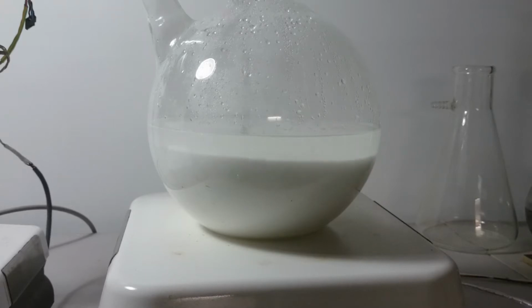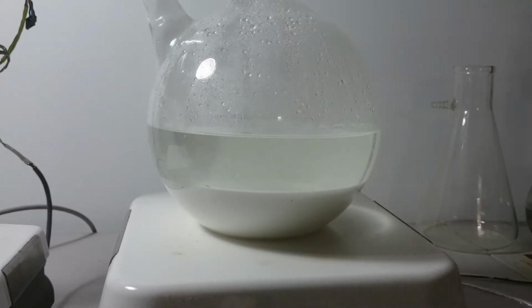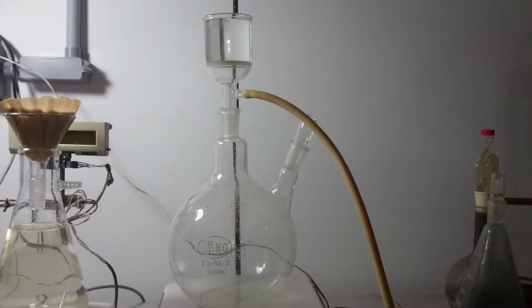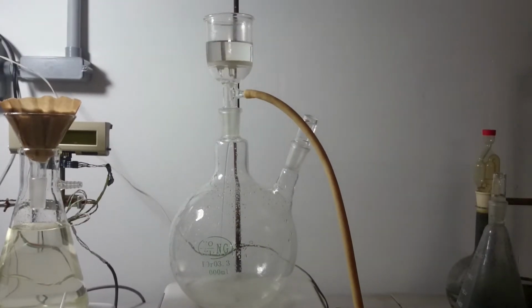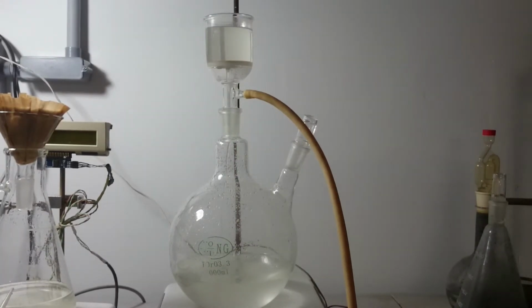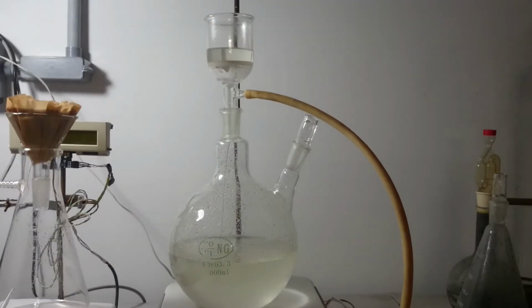Next, I wait for the solution to settle, and I filter off the calcium carbonate from the relatively clear solution. The slight yellowing is due to impurities from my sodium carbonate, which was a lot dirtier than I thought. In the future, I'll probably just use this for neutralizing any acid spills, and I'll invest in some relatively clean new sodium carbonate. With the calcium and carbonate ions no longer in solution, all that remains are sodium and propionate ions, giving us our desired product, sodium propionate.